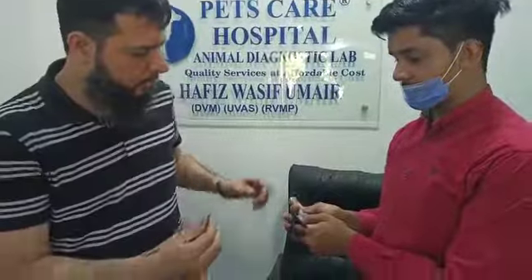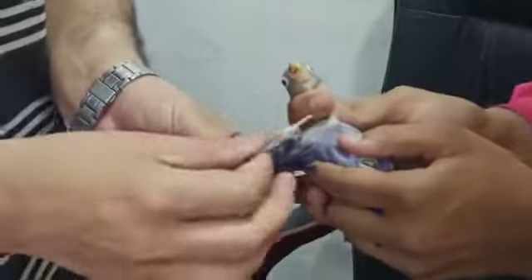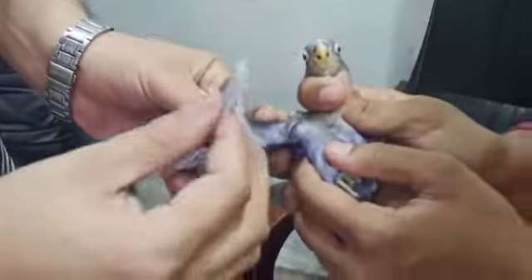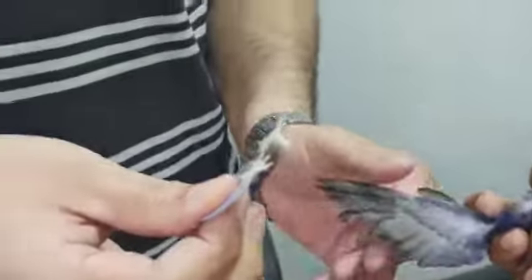I will tell you which feather you have to take. This feather is the name of the ring number.